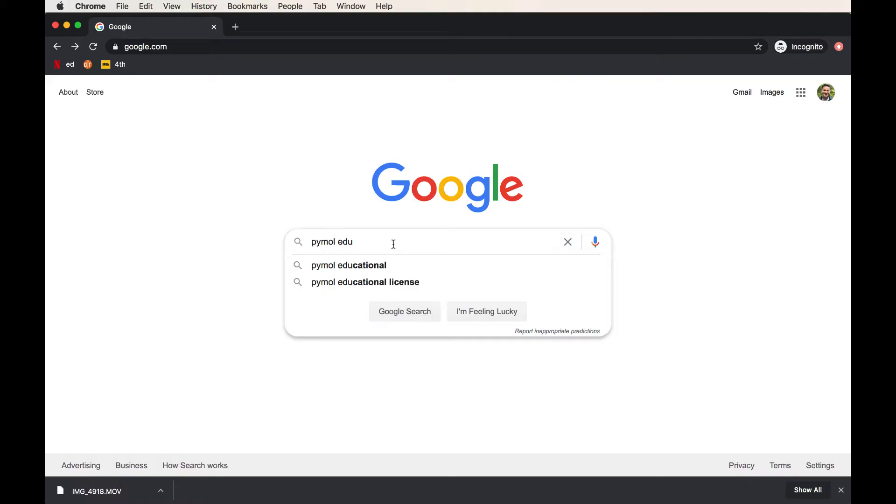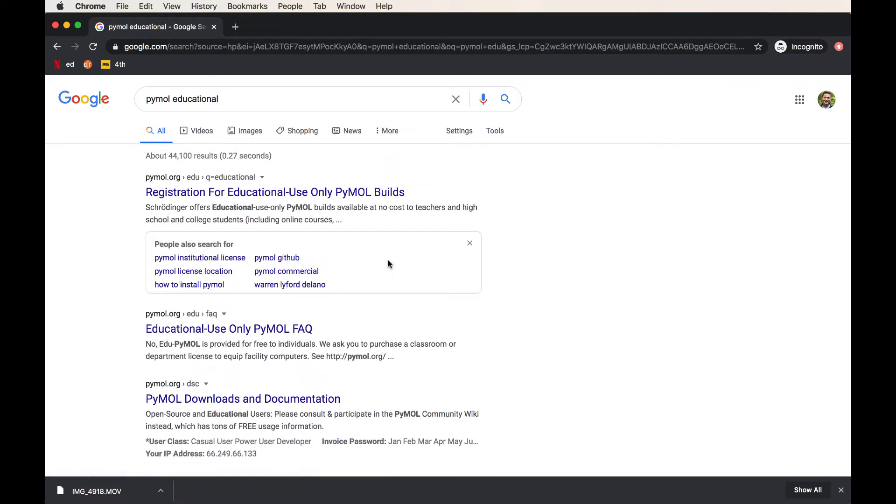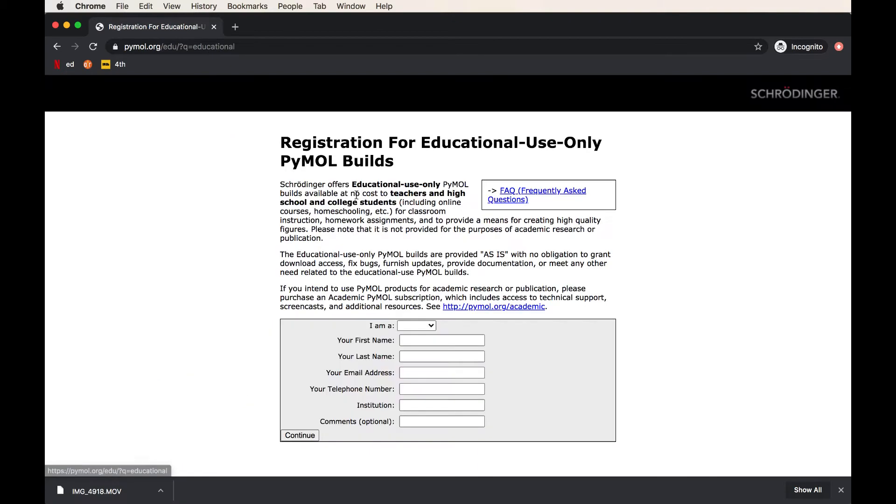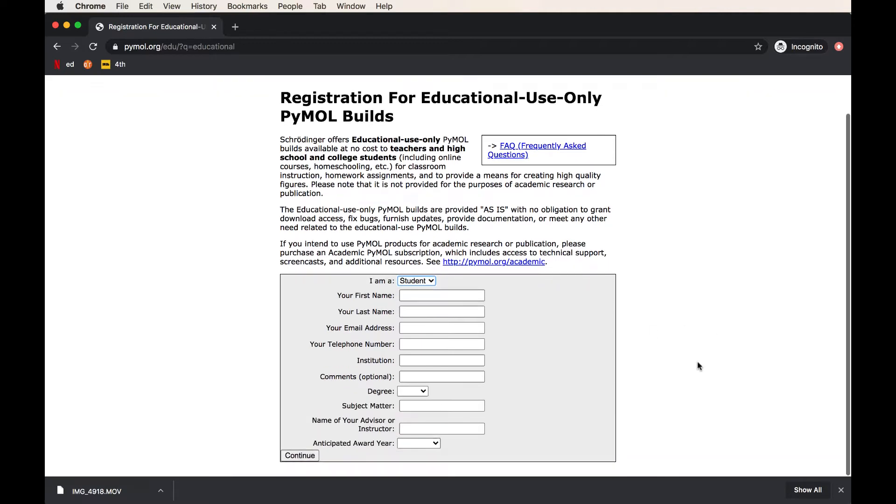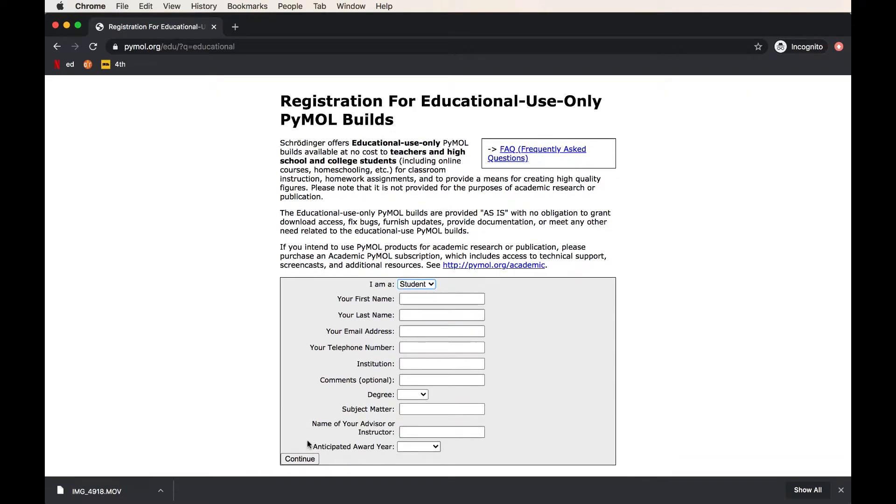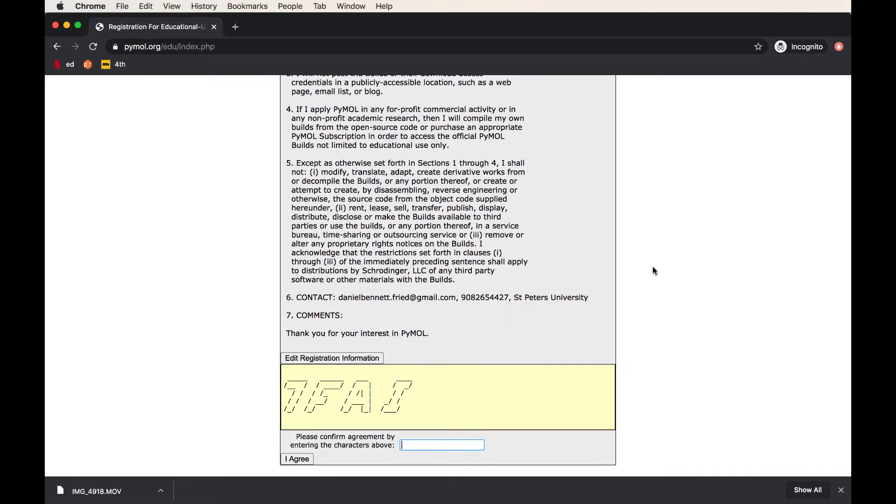The first thing that you're going to do is search Google for PyMOL Educational. It's very important that you go to this part of the PyMOL website because it allows us to download the free builds of PyMOL. You are not going to pay for PyMOL because it is free for educational use. You're then going to fill out this form according to what you are, if you're a student or teacher, and when you hit continue, you'll be getting an email with the download information for the software.